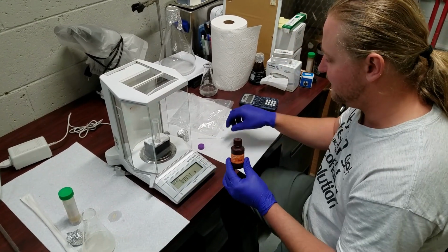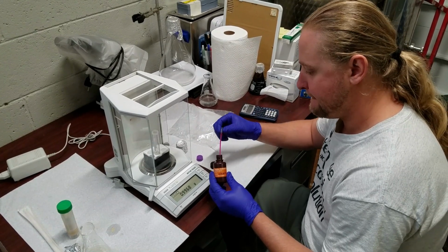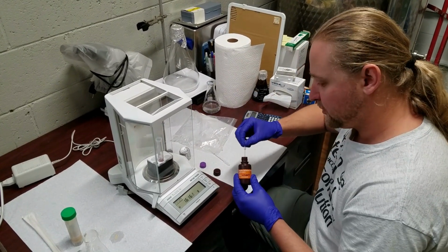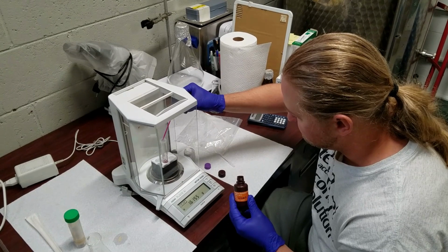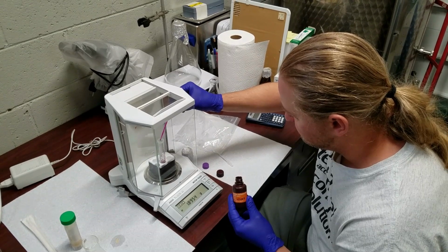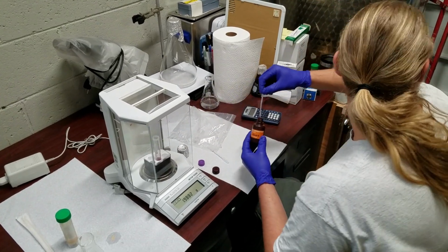And then we'll take our methylene violet and a new disposable pipette and put 1 gram of this. So our goal is 2 grams. Real close. And that would be the 2 gram mark.